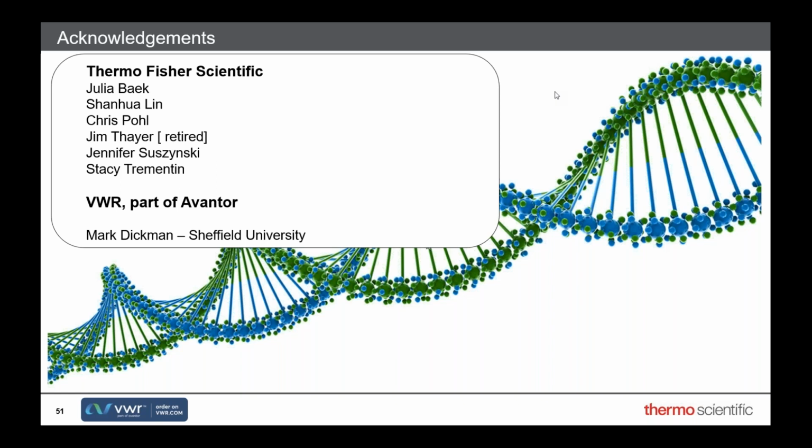And if you want to look at the 100-mer, you can actually desalt into the MS. But certainly if you're going to 100-mer, I wouldn't go past the DNAPac RP. It's a very good column. At 100-mer you're struggling to separate N-1, but it's close, and it's one of the best columns I've seen for that. And again, I'd be pushing the triethylammonium acetate eluent system with the HFIP.